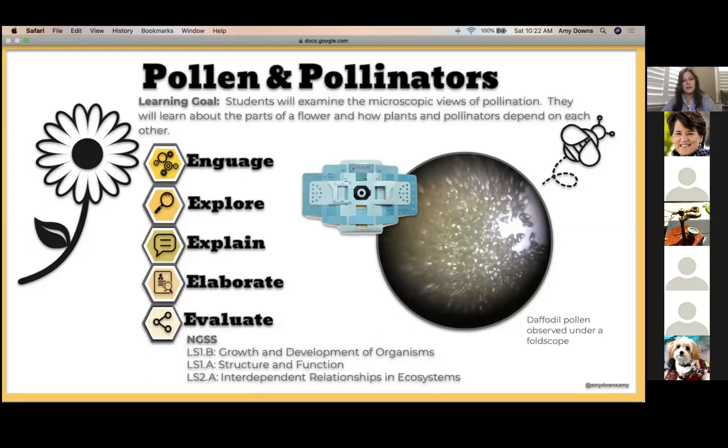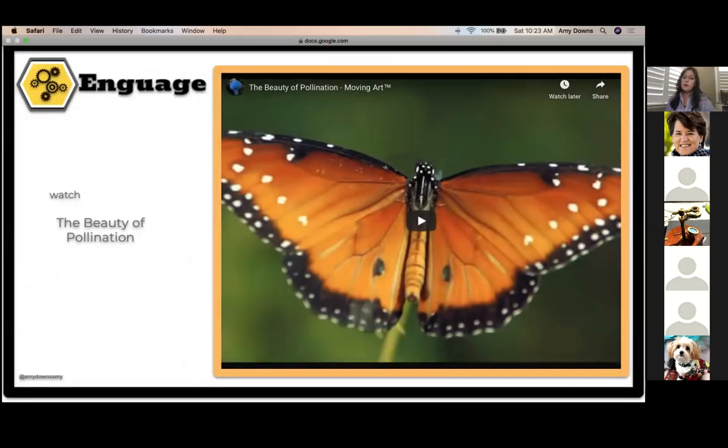I think that just makes science so much more engaging. Most primary grades, I believe, have some unit where they go through the life cycle with a Luna moth, so this would fit well for primary students.